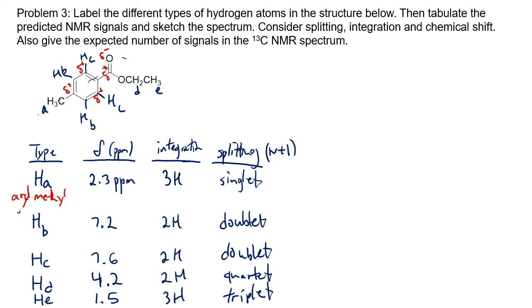It's really easy to go and plot this on our sample spectrum. So we know that we only need to go up to about 8 ppm. So we're going to go from 8, put 0 over here.